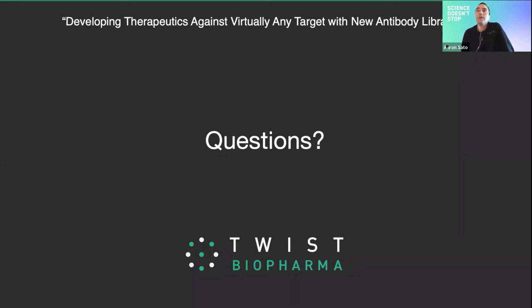All right, great. Do you have any antibodies generated from rhesus, insect, or marsupial cells or species? That's a question for you, Aaron. I think the answer is no. Like I said, we typically make antibodies either in HEK-293 or CHO. So those are our primary cell systems. We don't have a lot of libraries from antibody diversity from those organisms. But I hope that answers your question. Yeah, if they needed a custom antibody library with that source of diversity, then that's something that we could work with them on. Sure. Okay.